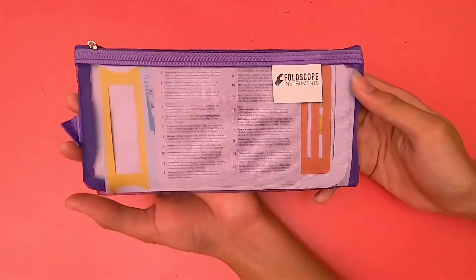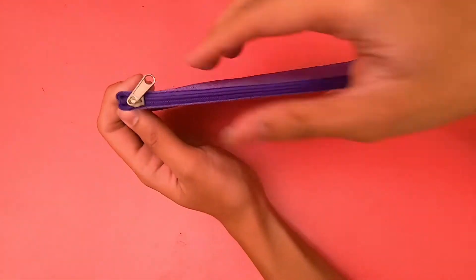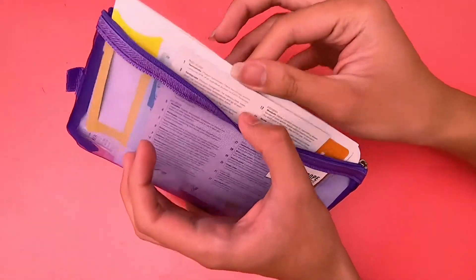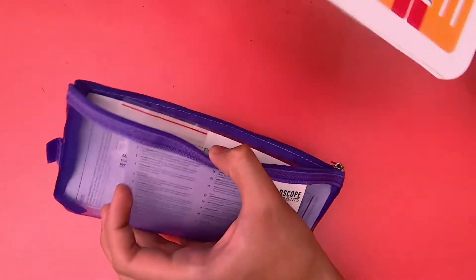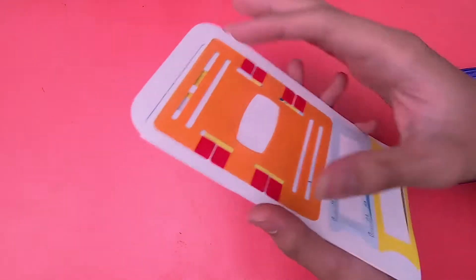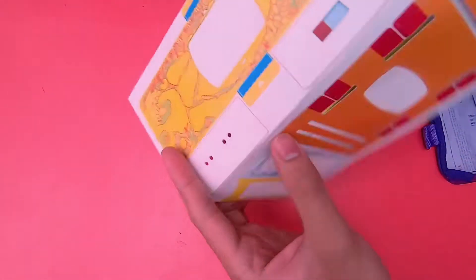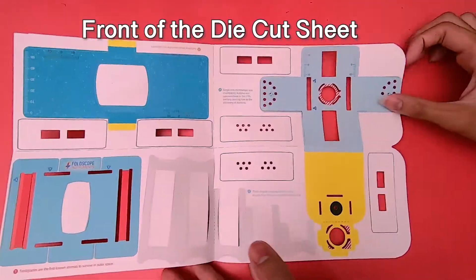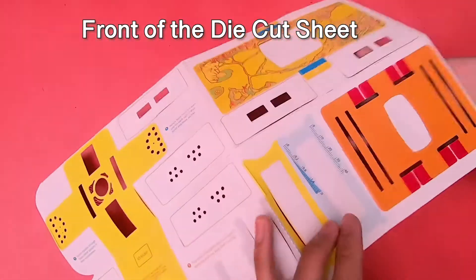Now, let's pull out our die cut sheet. The foldscope that we are assembling in this video is a classroom kit. This is the die cut sheet when it's folded. This is the front. And this is the back.